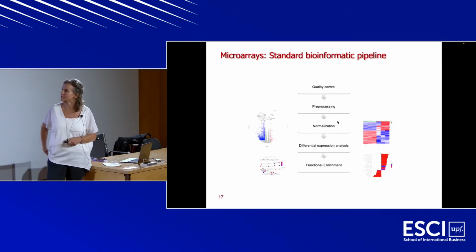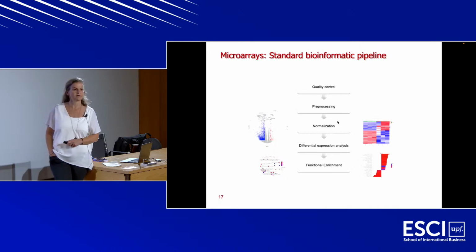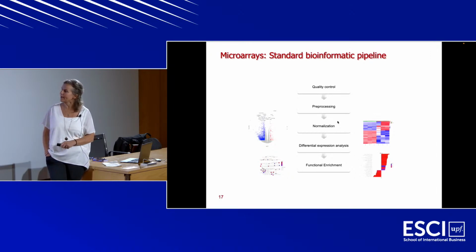One of the plots that are used mainly is a heat map that is showing us the difference of intensity. Do you know this plot? The heat map? Anyone? So what it's showing is here the differences of the conditions. So we have 3 samples here that might be tumoral and non-tumoral, and those are the profiles; in rows we have the different genes. And here we see the intensity. In red is high intensity, in blue is low intensity. So these samples here have a block of genes that are low expressed, and those are high expressed, and the other way around for this normal sample here. We have also the volcano plots. Here we have the most differentially expressed genes between the conditions that we are studying, and here taking into account statistical parameters.